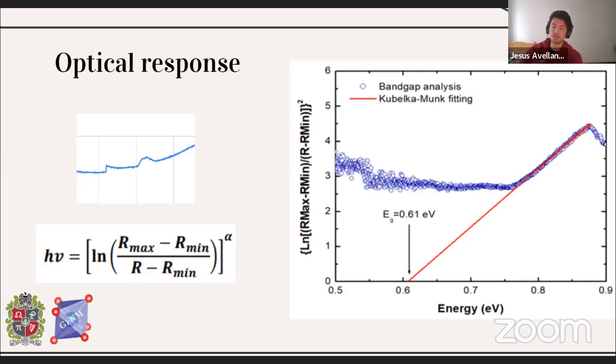Basically, when the incident energy is within a certain threshold, this energy causes a vibration in the bonds of the material. These peaks are static, so they can be seen in both graphs obtained. They didn't change position between absorbance and reflectance curves. With the data from Rietveld and VESTA, we obtained the bond distances within the material. As an analogy, let's think of the bonds as if they were strings. So the higher the vibration energy that reaches the said bond, the shorter the bond, and vice versa. But as I said, that was a plus analysis beyond the important analysis of this part.